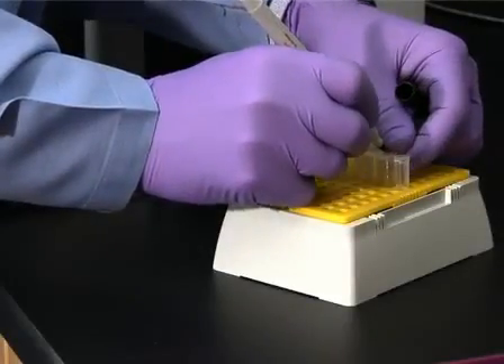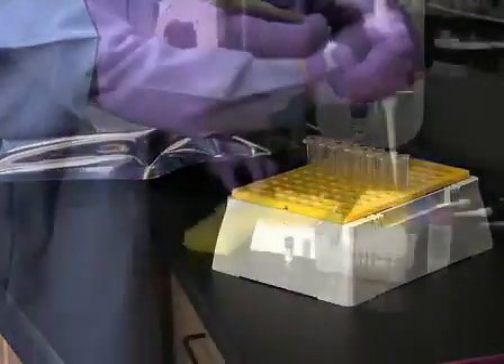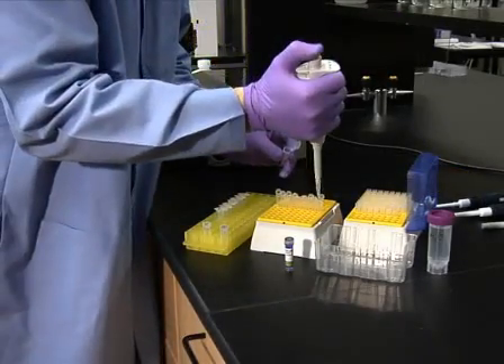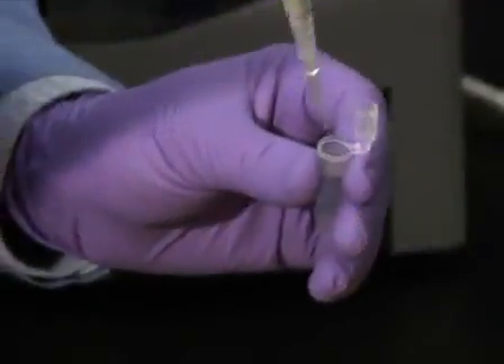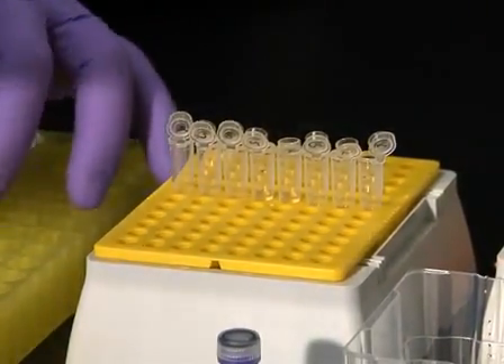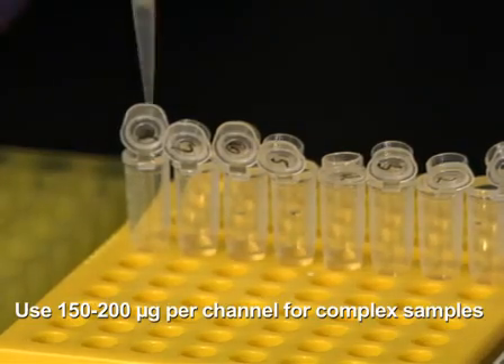Begin this procedure by setting up and labeling up to eight 500 microliter tubes. To each tube, add up to one milligram of the protein sample in a volume of up to 112 microliters. The amount of protein in the sample depends on the complexity of the sample. For more complex samples such as the tissue homogenate used for this demonstration, 150 to 200 micrograms per channel will generate the best results.